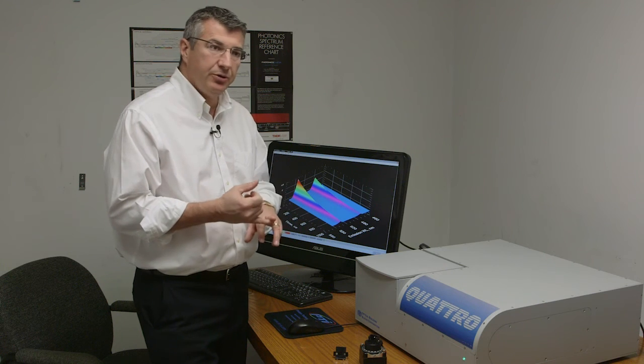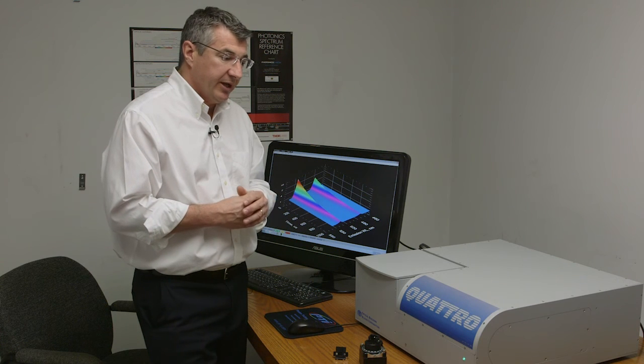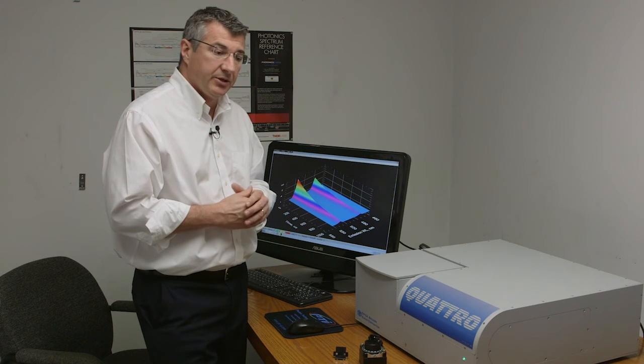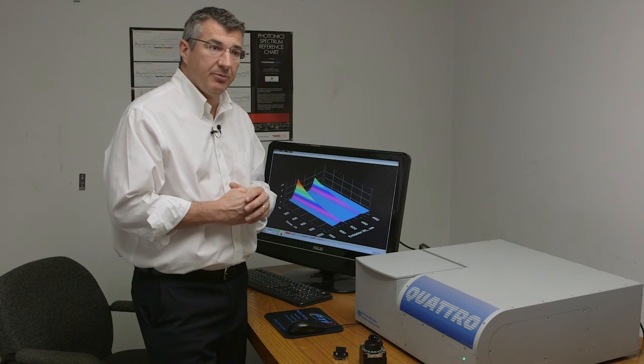Quattros are delivered as a complete instrument, there's no installation that's required, you just simply open up the box, take out the instrument, put it on your bench top, there's two USB cables that connect to your computer, hook them up and away you go. It really couldn't get any easier, it's auto-calibrating, there's really nothing for you to adjust or to worry about.